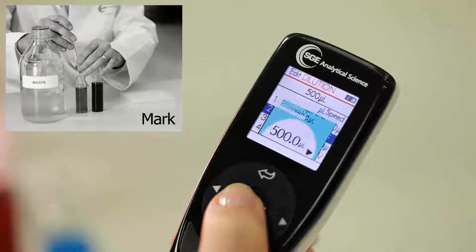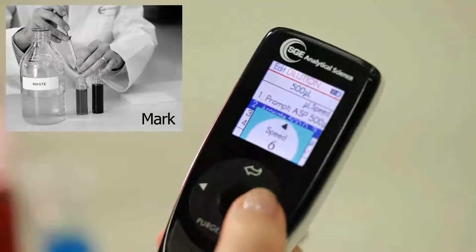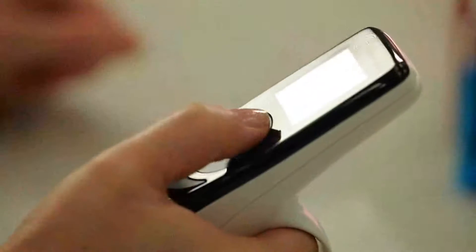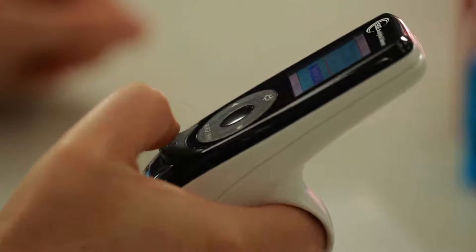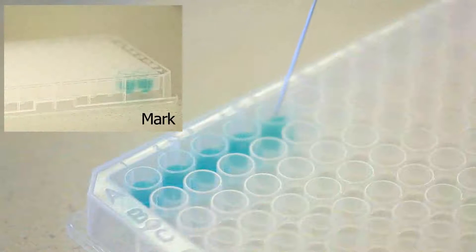First, Catherine selects the volume of liquid and speed for aspiration. Next, Catherine sets her method to dispense the liquid five times for each of five wells.